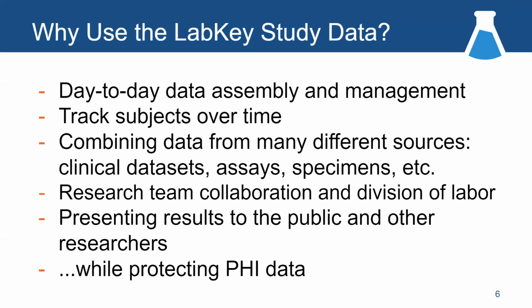It's also a great place, again, to just collaborate on data together and to divide and conquer your work around this data. Somebody on your team might be assigned to quality control. Somebody on the team might be assigned to data modeling. Somebody else is a specialist in analyzing the data and building visualizations around it. Again, LabKey's got all those features in place.